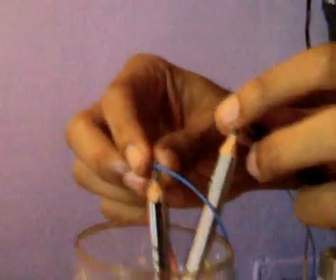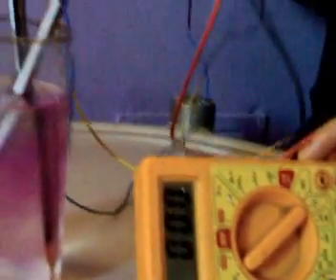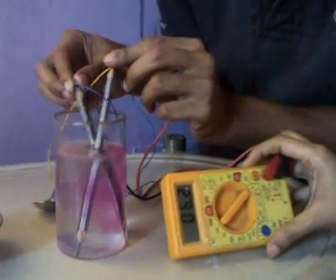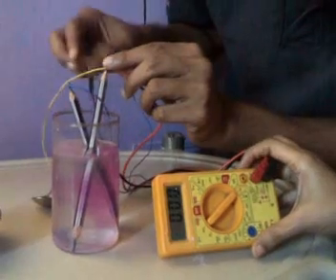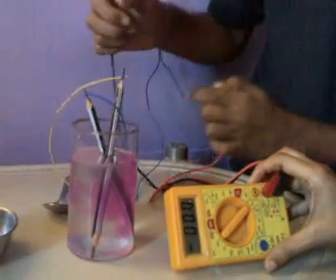To check which is the anode and which is the cathode, you are going to use a multimeter in DC mode, connected across the leads. You can see it's showing a negative voltage, which means we are connected the wrong way. After correcting, it is now showing a positive value. That means the pencil across which the pink color is developing — the black wire — is the cathode, and the red is the anode.